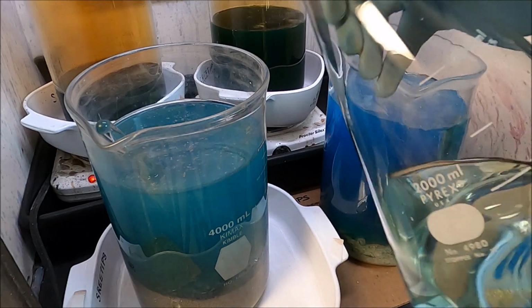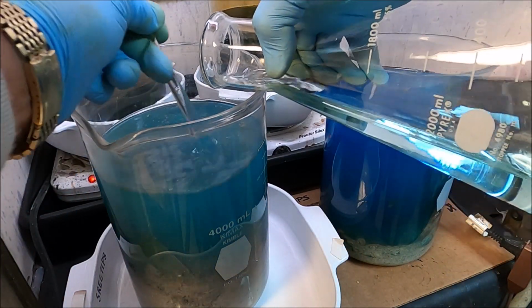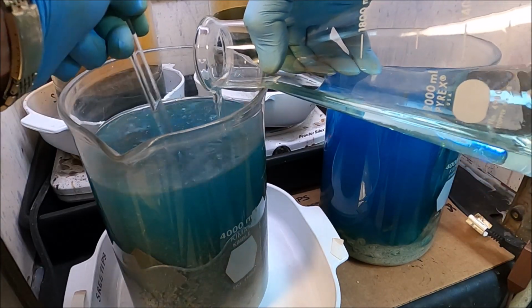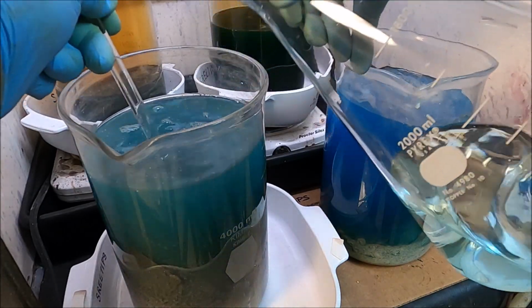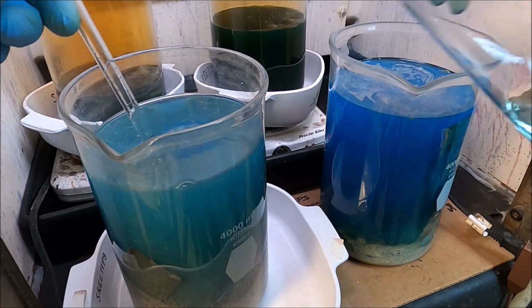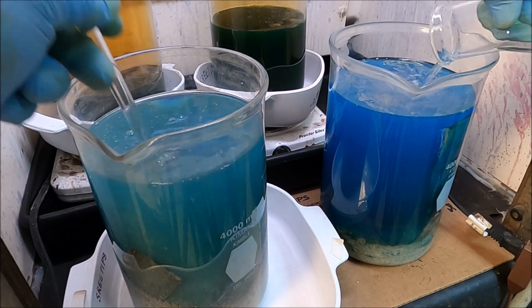Here's our solution. Going to add it right to the beakers here that have copper in them, and the silver will come out of solution onto this copper in both of these beakers. Getting full there, almost to capacity.